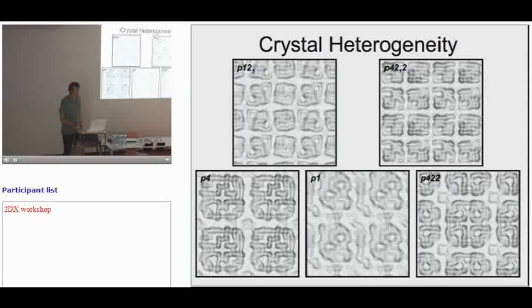I can sample to almost 75 degrees, so I sample somewhere around 93 or 94% of Fourier space. So the missing cone with my crystals, because I can tilt to such high angles, is extremely small. And also when you use crystallographic refinement, you force bond lengths upon the structure, and so the differences are extremely small. The RMSD is about 0.4 between an X-ray structure and an EM structure. So they're superimposable. If I gave you just the two backbones, you wouldn't be able to tell the difference.